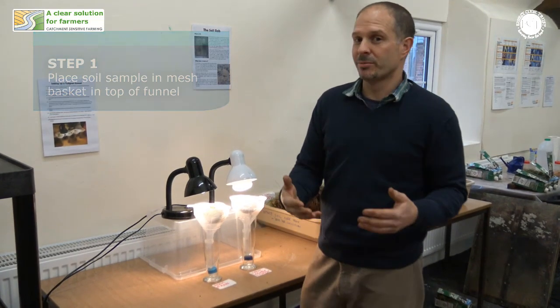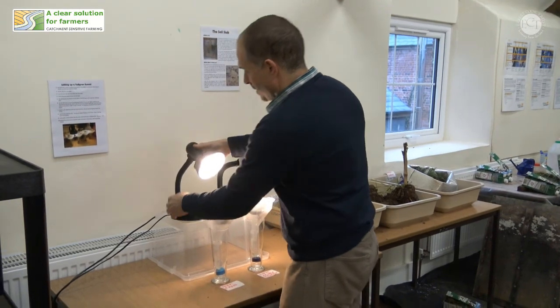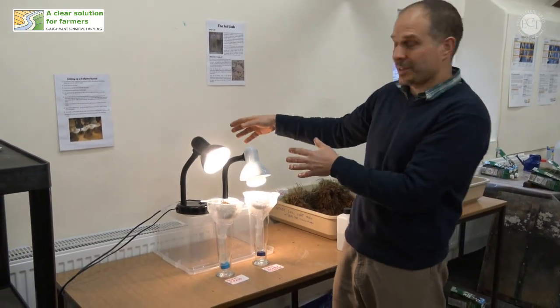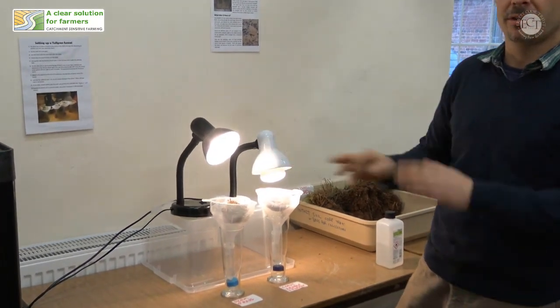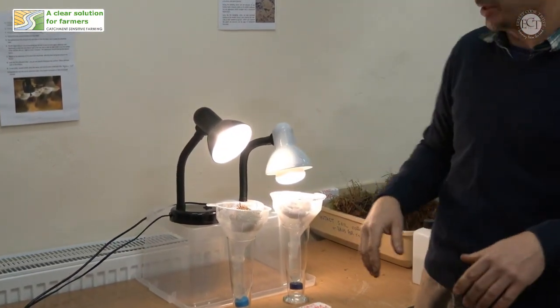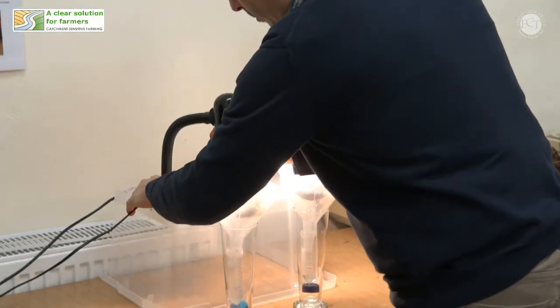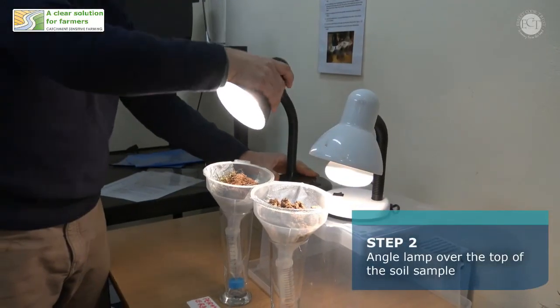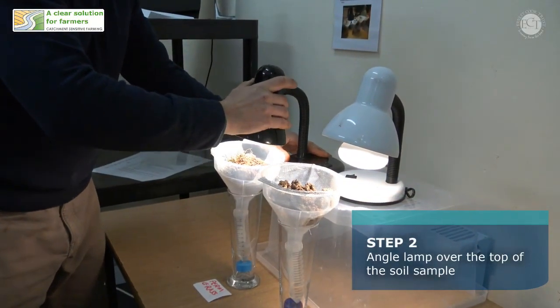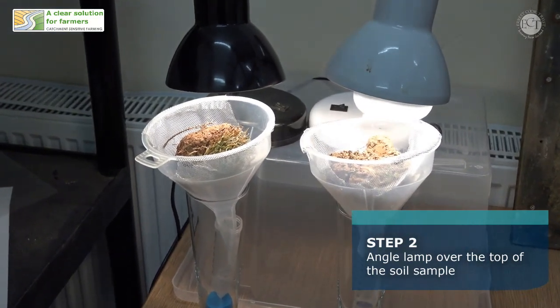To encourage them to do that — because they might actually hop away in the other direction — we've got to give them a bit of an incentive. This is a standard bedside table lamp with an incandescent 40 watt bulb. Don't go any higher than 40 watts or you might end up cooking them. You simply angle the lamp down over the top of the soil sample, and over the course of a few days it will dry out the soil. The animals don't like the light, the heat, the warmth, or the dryness.